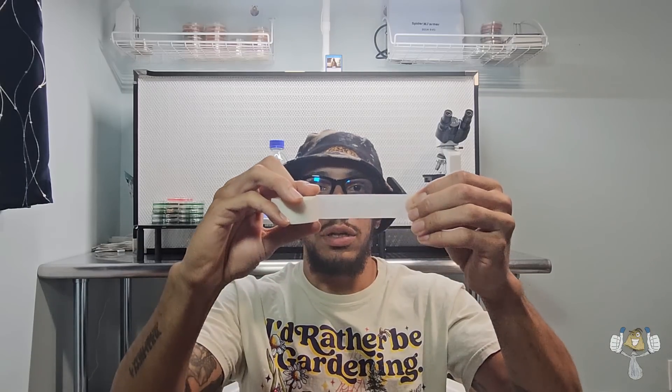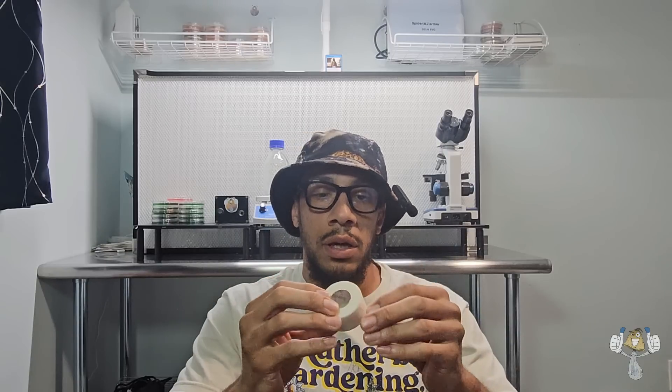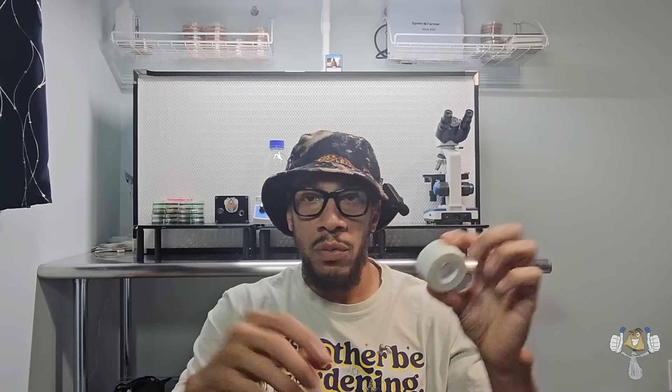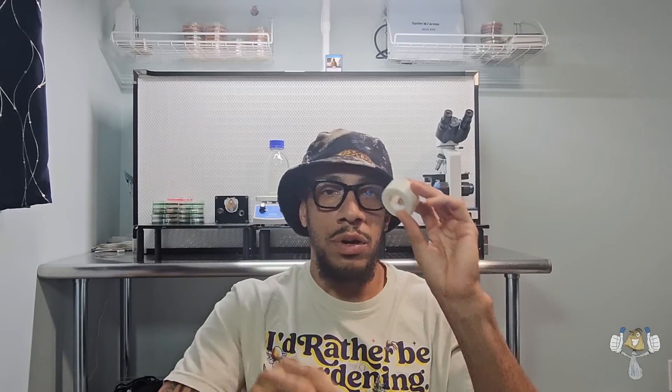Micropore tape. This is surgical paper tape that we use to cover up any ports or cuts that we make in our grow bags, grow jars, or grain jars. We use micropore tape to cover up any holes for fresh air exchange and to keep a sanitary environment for whatever is inside. You can see the fibers of the tape — it's very easy to tear. This is our micropore tape.